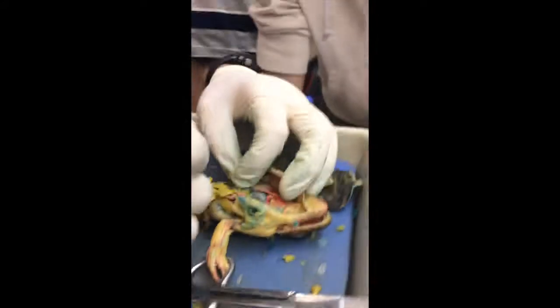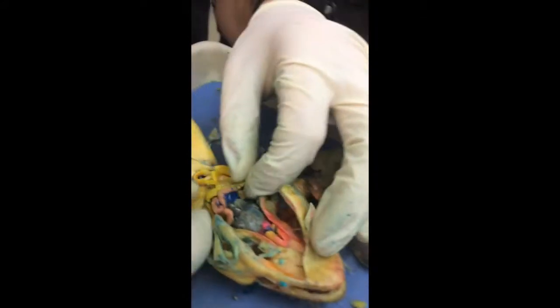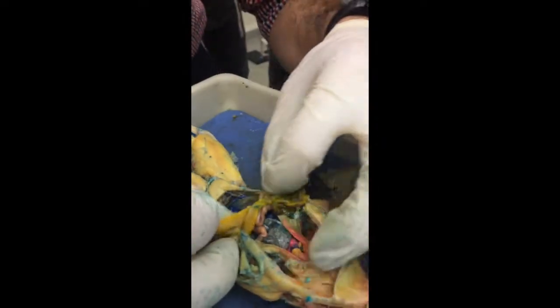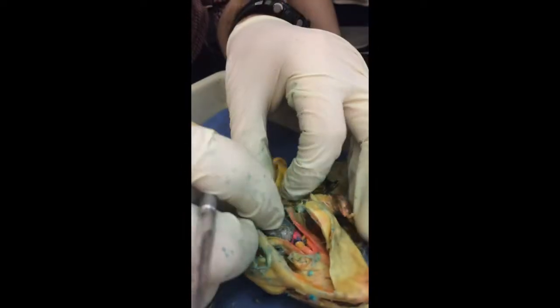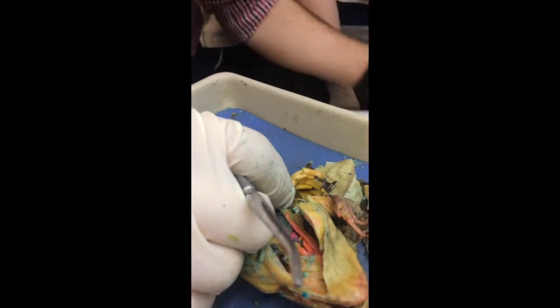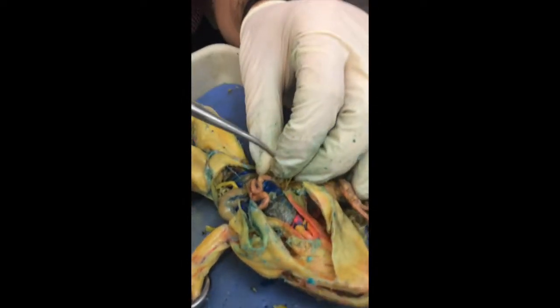All right, guys, let's try and make this clear. That's definitely intestine, not even a question. The yellow things? Nope. The red things are the intestines, right? Okay. Red's intestine. Wow, check out that liver. The yellow things are fat bodies.